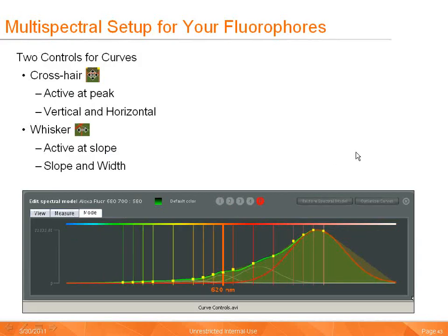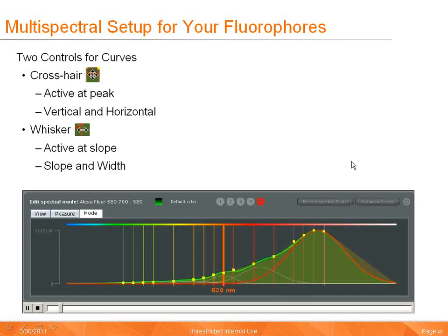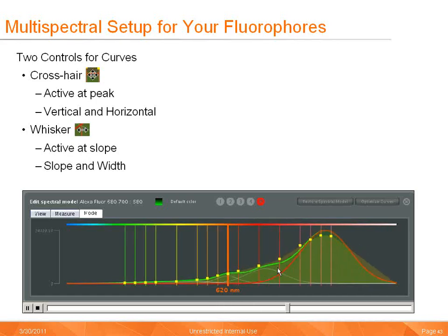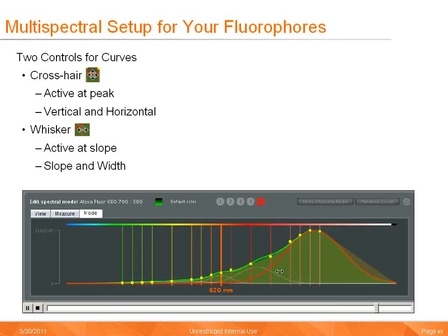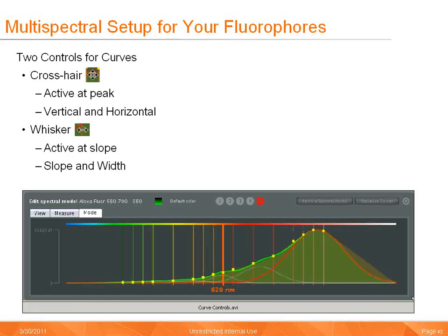There are a couple of nuances for the curve preparation that should be noted. There are two controls for adjusting the curves. The first control is active when the cursor is positioned near the peak of an active curve and shows as a crosshair — this allows for vertical and horizontal positioning of the curve. The second control is active when positioned at the slope of an active curve and shows as a whisker — this adjusts the slope and width of the curve. The red Gaussian should be adjusted to set the positioning of the green Gaussian so that it matches the actual data.